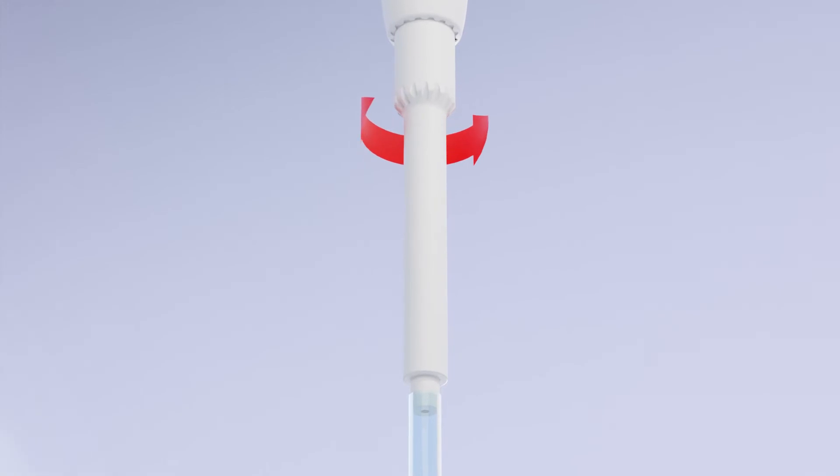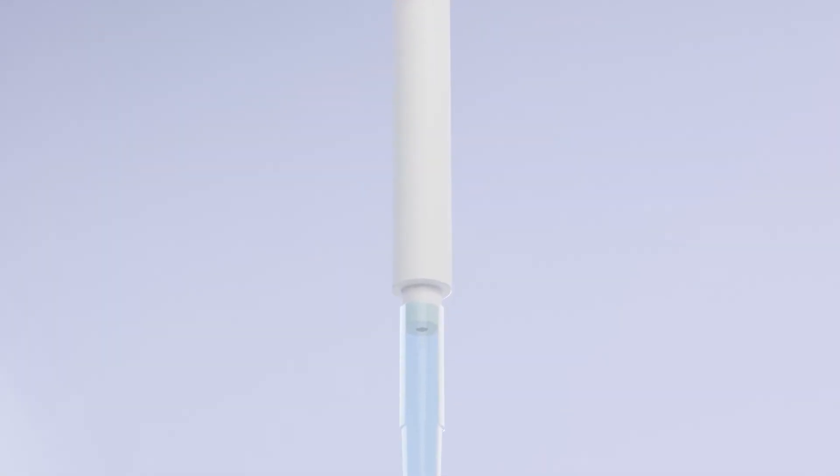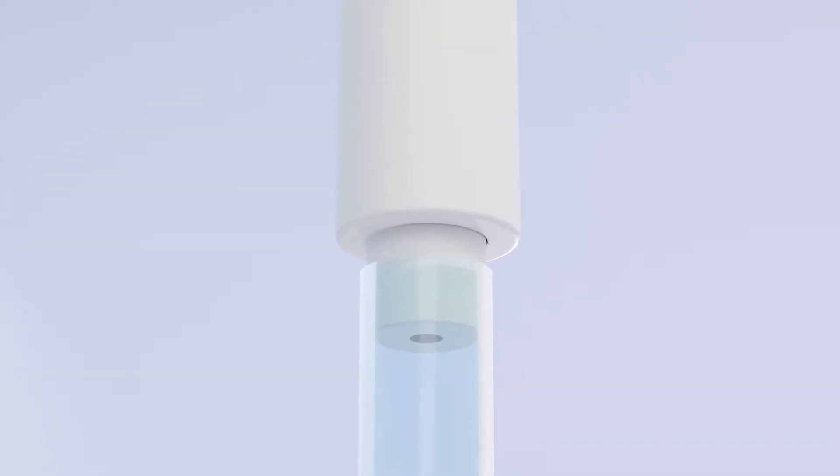Adjust the flexible tip ejection with a single rotation. The Zarpetta M is compatible with a wide range of pipette tips.